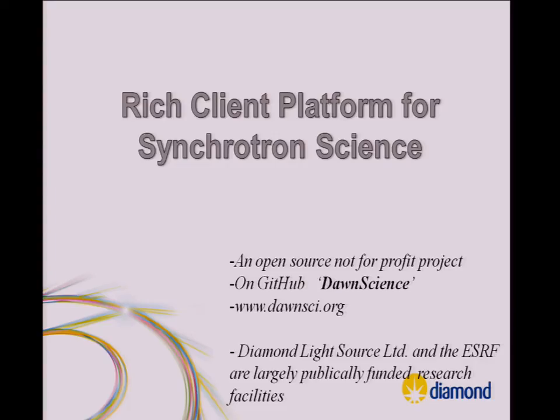One, I'm going to explain a bit just for fun, just for people that don't know what synchrotrons are, and just have a look at some of the hardware involved because it's rather fun. And in the second half, I'm going to show you some demos of the data analysis software, and explain some of the software development that we do.